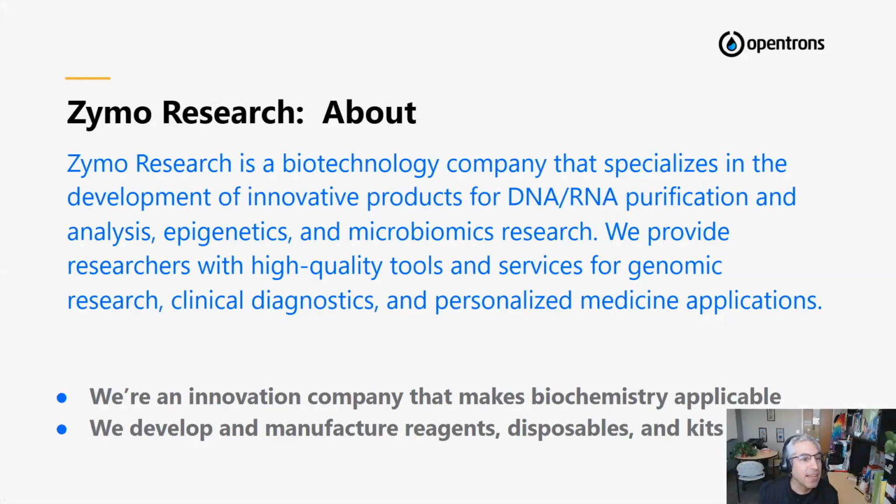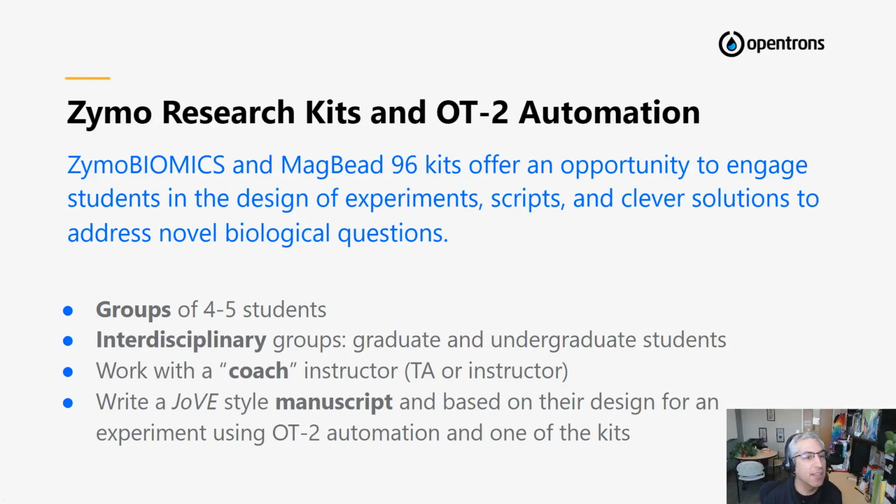So this allowed us to really have fun with the process of automation and leverage the protocol designer as well as Zymo kits and expertise from the Zymo automation team, to have students design really novel applications to, for example, screen bacterial isolates after extracting DNA and setting up digital PCR or real-time PCR, extracting RNA in 2 different conditions for bacteria treated with heavy metals.